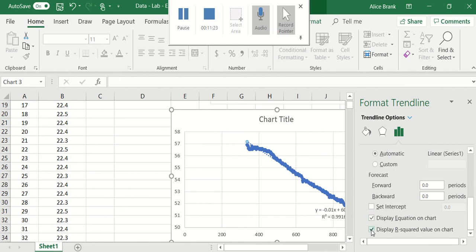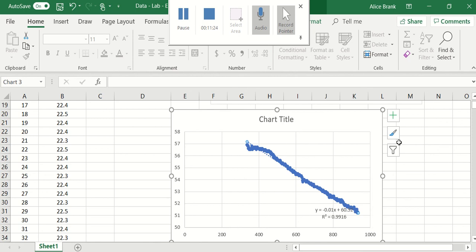And if you're interested in the r squared, that's pretty good. I'm going to delete the r squared though. Go away. Well, because I'm going to copy and paste. So I'm going to copy this.